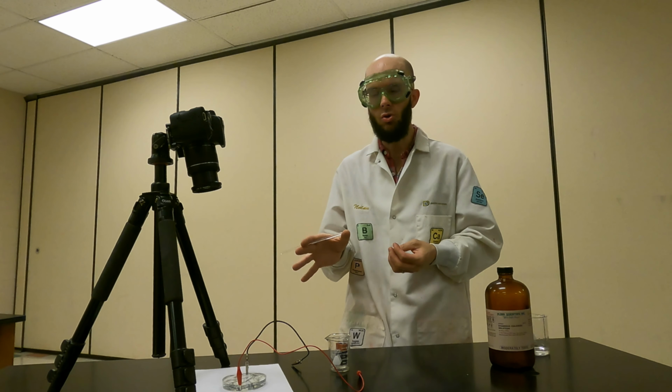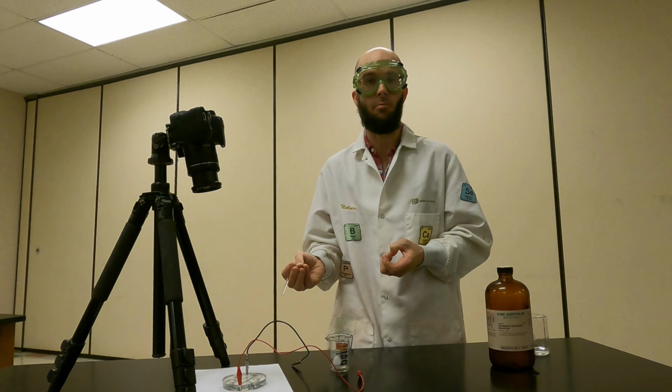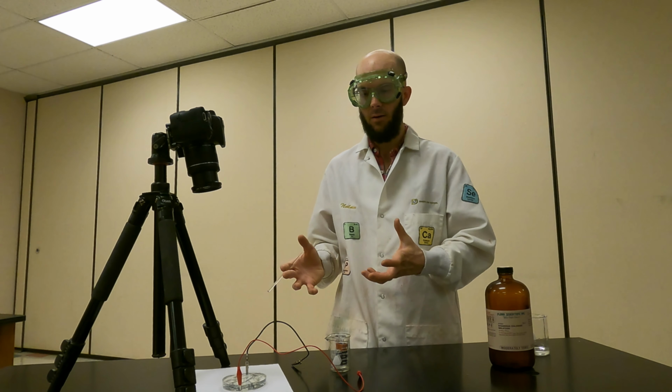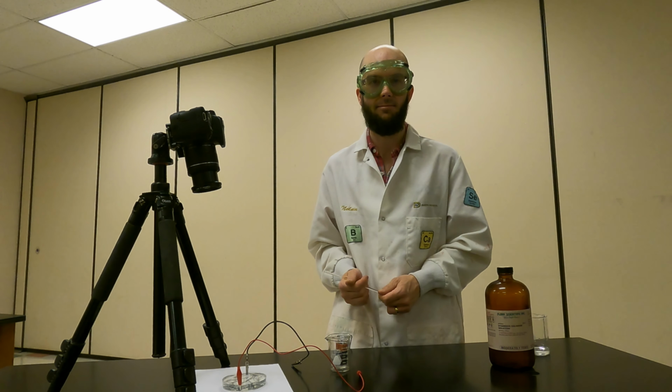This is a little bit of an unusual decomposition reaction in that one of your products is a solid metal. So, pretty striking example of a beautiful decomposition reaction. Now, in the decomposition reaction that we just saw in the lab, we started out with tin chloride, that's SnCl2. And when I hit it with some electricity, we saw this beautiful metal appear. Now, if you understand how a decomposition reaction works, you might have guessed that that metal was tin.